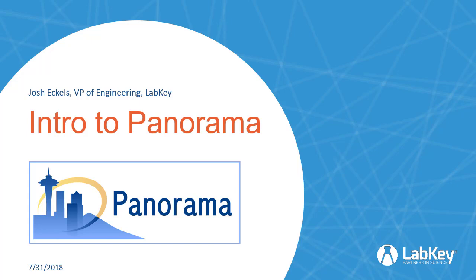I hope what comes of this is people begin to realize and think about how they could use Panorama within their lab or within their company, in a way that lets them manage documents, share documents, and come up with different ways even of doing analyses as well. It's a very flexible framework. Anyway, Josh Eckels is the Vice President of Engineering for LabKey, and he'll tell you a little bit about Panorama.